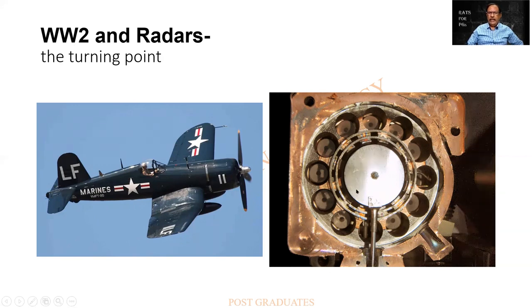As I had mentioned earlier, this is the central region wherein there is an energy that is being obtained in the cathode. There is a breakup of the molecules. Usually what happens is they are confined within a circle, but here provision has been made for the extensions of these. I will be showing this in the next diagram also. So you find that there are pockets of extension and it goes within.